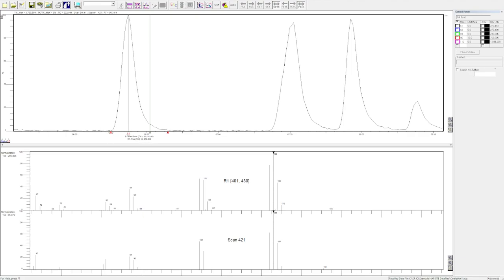But if I had more noise, you'd want to be more careful where you place these. And be careful not to bring your area tool inward to where the peak has already started, because then it assumes the starting of the noise is this intersection point where you can see that red line going up. So it cuts off a whole bunch of the area you want to calculate. For instance, we were at 30 million a second ago. Now just moving it in that little bit is now saying it's only 24 or so million.